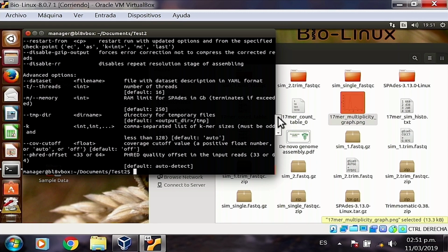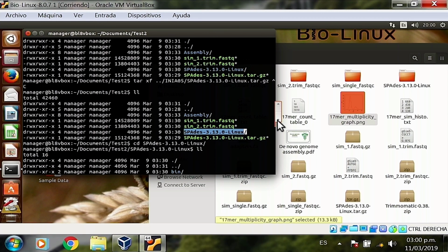Then you put bin so that you go into the binary directory, and then you just run spades.py, and you shouldn't have any issues getting this help. So everybody should be in the new directory that you've created. You can call it test2, test, assemble, whatever you want. Just remember that you're under documents, and the name of the directory you created.